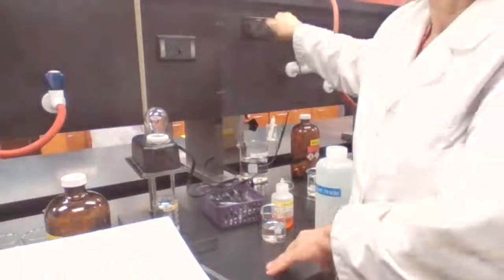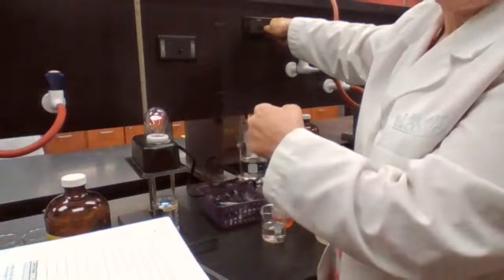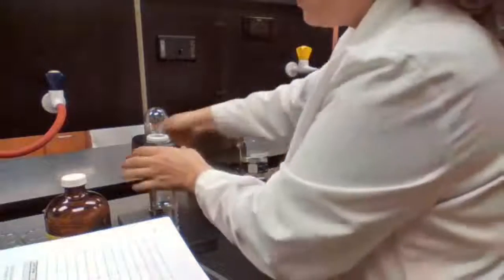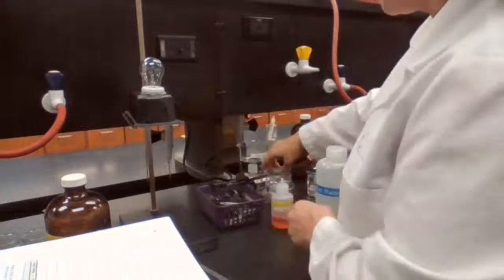So you see that dimmed light is created there. That means weak electrolyte. And why is it weak electrolyte? Because acetic acid is a weak acid. Even then, it has to be in water in order to show those ions.